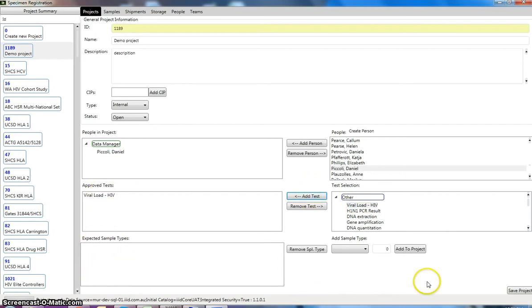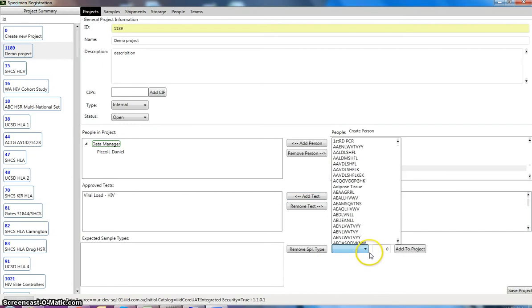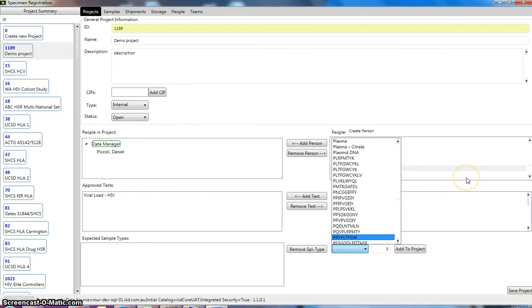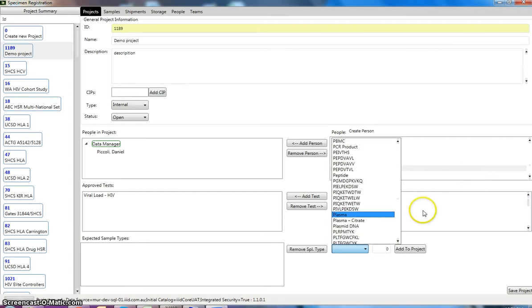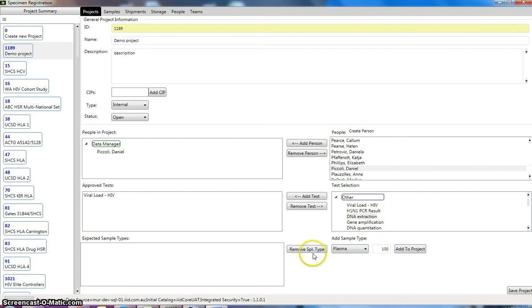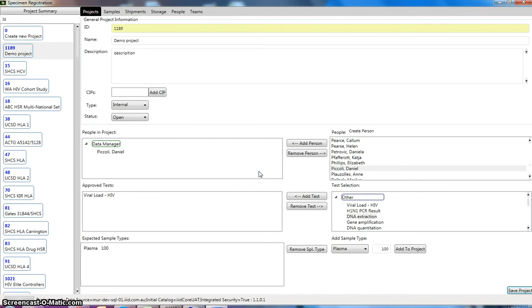And down the bottom here you can see expected sample types. This is where we select sample types that we expect to register into our project. So if we say we expect to receive 100 plasma samples, this is just for an example purpose. And we can go add to project and then save that project. So now our project is fully registered.